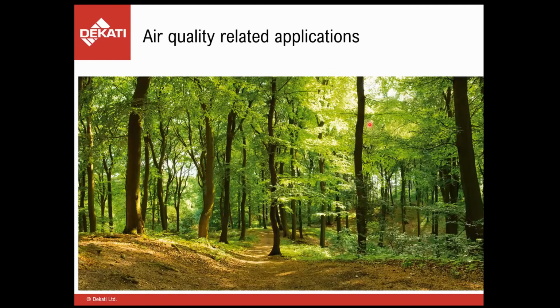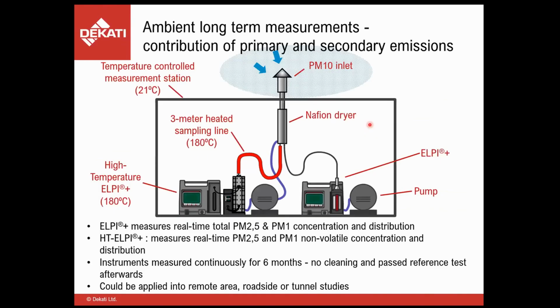Moving on to other applications now related to air quality. There is quite a specific interest to do high temperature measurements also related to air quality. And the interest here is to look at what is, once again, volatile in the atmosphere and what is the solid fraction. And the way that this sort of a study can be done, I have an example and some data.